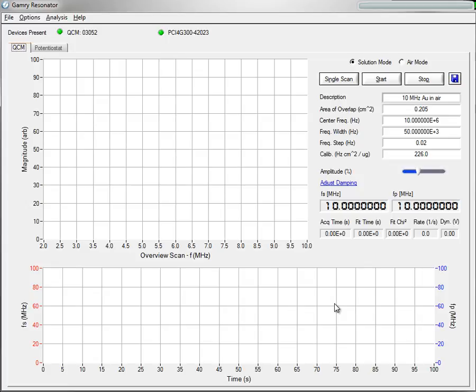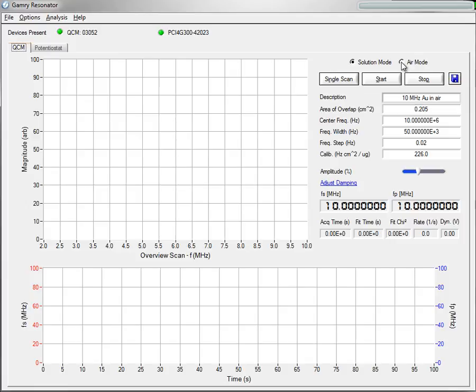The purpose of this video is to introduce you to a new feature in the Gamery Resonator software. With version 6.1 of our software, we've introduced an Air Mode operation to the Gamery EQCM 10M.